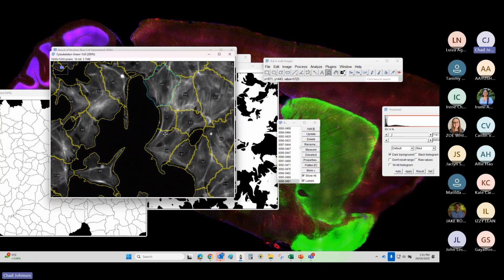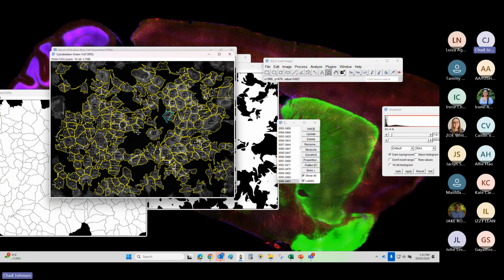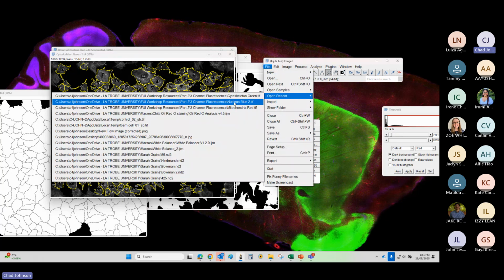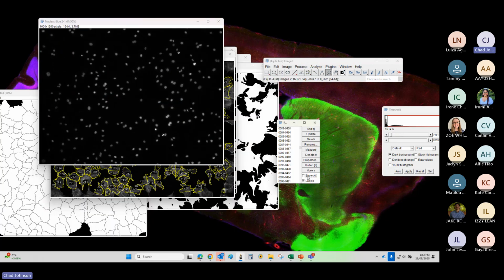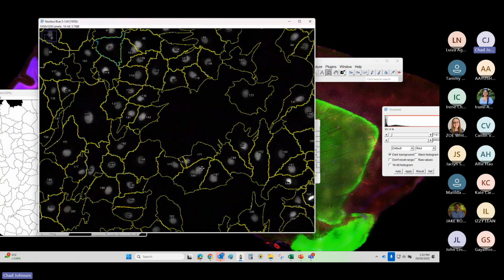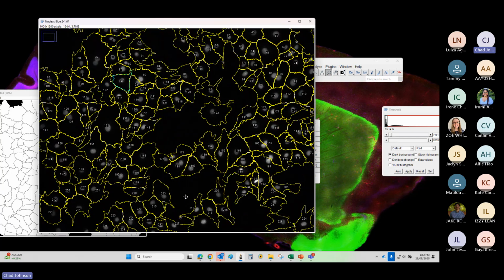That's probably not real, but that's all right. So you can also go back to the original nucleus image as a check and then add that to there. And what you should really be seeing is one nucleus. So there's obviously an issue there. So we could go back and do some watersheds and do some filtering and things like that to make this a little bit better. But I'm always happy with 95%.